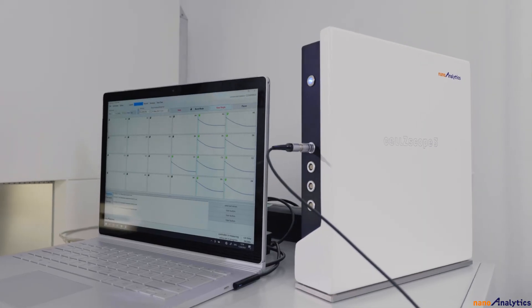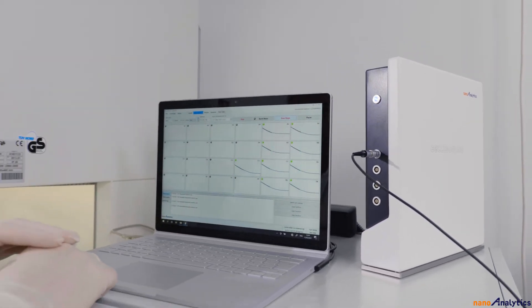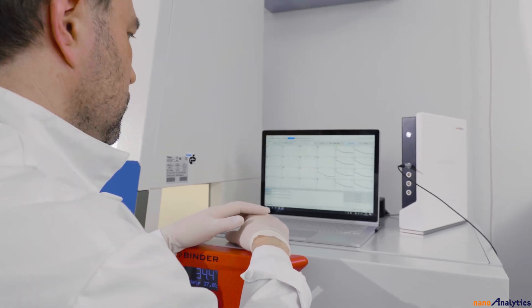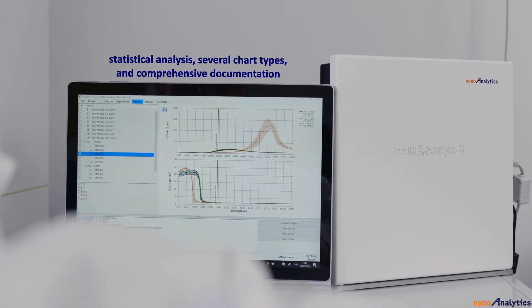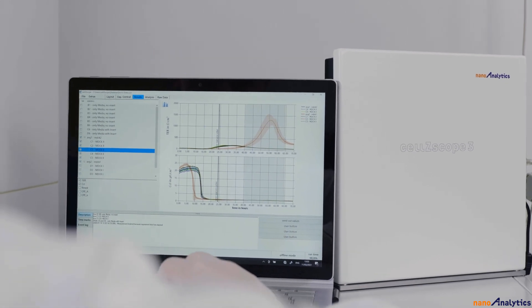Barrier property dynamics are visualized in real-time. The user interface features statistical analysis, several chart types, and comprehensive documentation of experimental parameters and data.